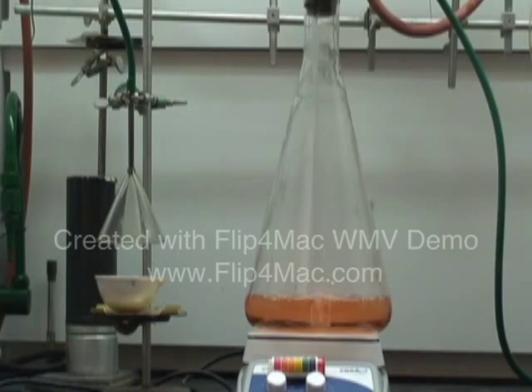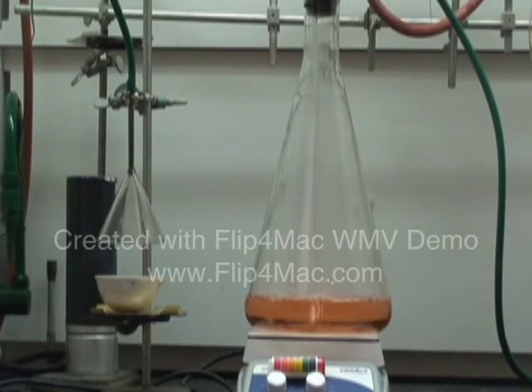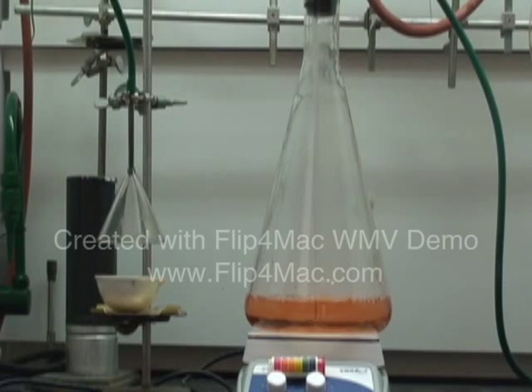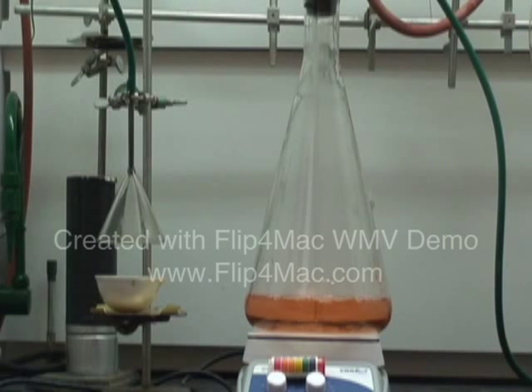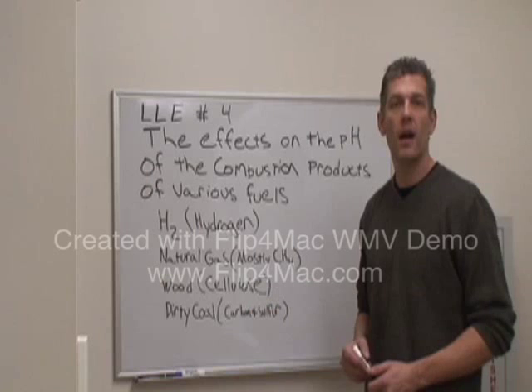Notice the pH is now somewhere between a pH of three and five, closer to a pH of three. Please account for all your observations. Stay tuned for LLE number five. Thank you so much for watching.